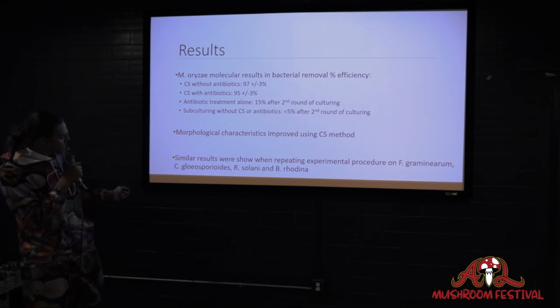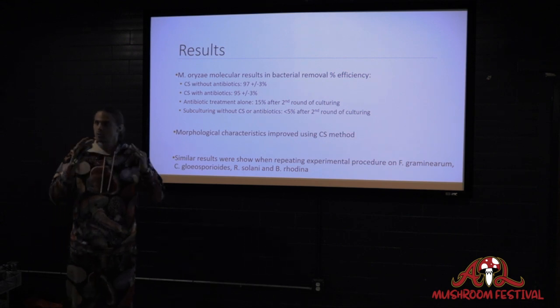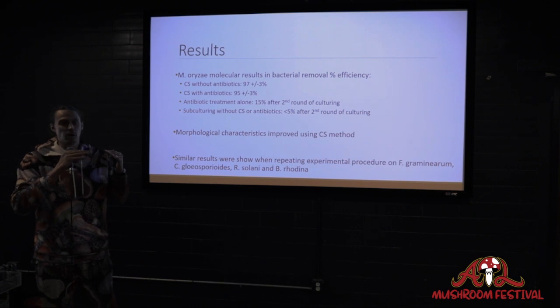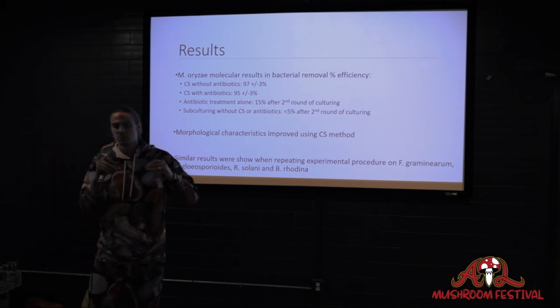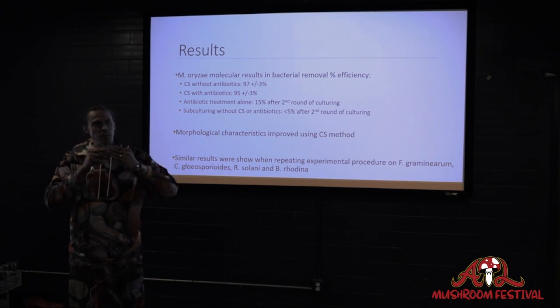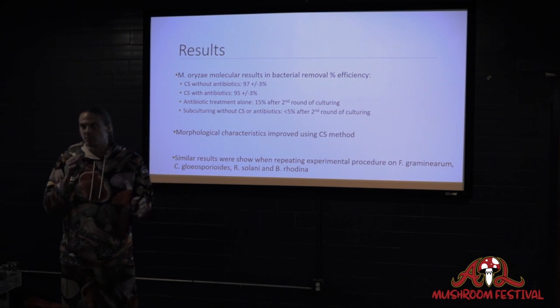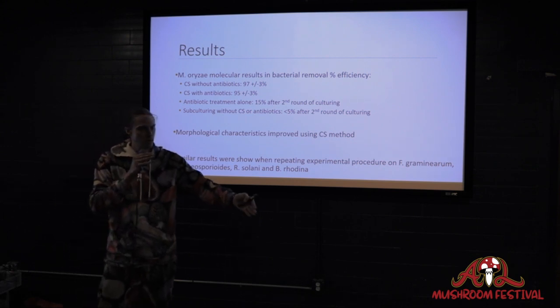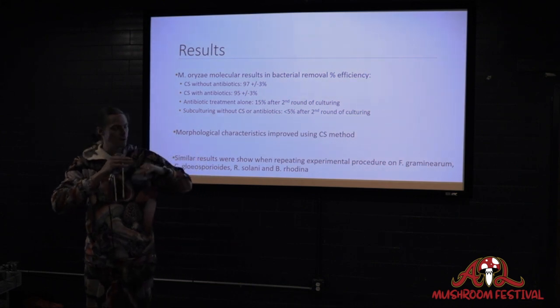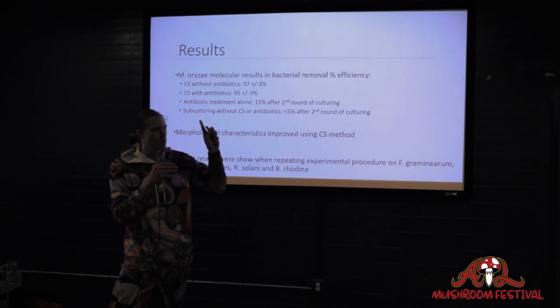So what was interesting is that the technique improved the morphology, the look of the mycelia in the cultures, and it produced stronger, better, healthier growth. And what was thought was because the mycelia had to grow through the agar, it would separate the weaker genetics from the stronger genetics. So the weak stuff would take longer to grow through the agar than the stronger genetics, because most fungal colonies are multiple genetics mixed in. They're not monoclonal, one gene.